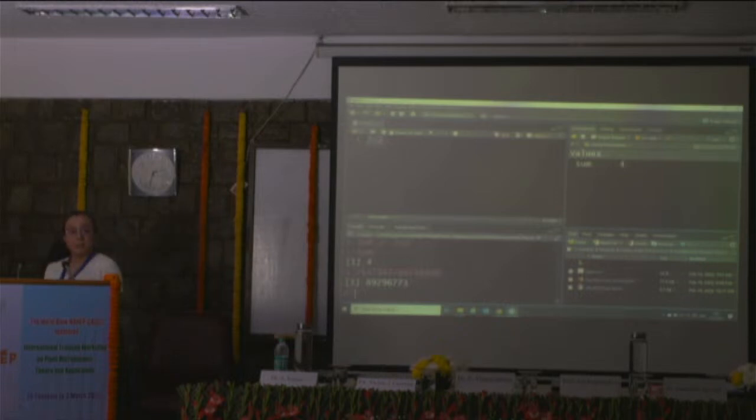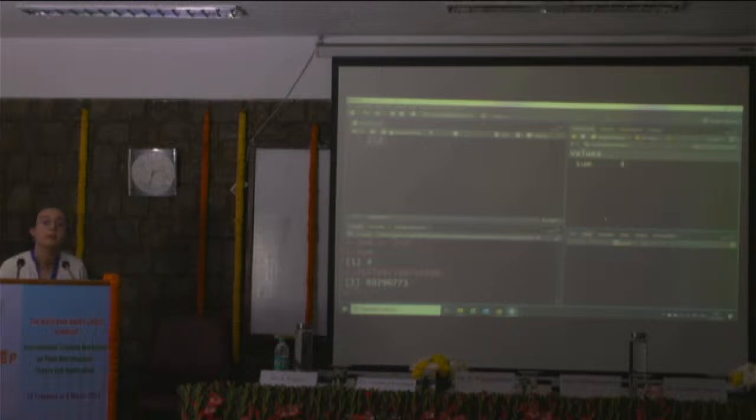And then another thing, a very good advantage for RStudio, and a great reason that the biologists I know use RStudio for the analysis, is the plots. You can see the plots right there, and not many programming languages have this. Usually you just have to write all the code, cross your fingers, and hope that the plot that you want is actually being produced, and then check later on. But with R, you don't have to do that. You can generate your plot and immediately see it in the plots tab. Right now it's going to be empty because we don't have any plots, but in the exercise we will have some, and you will see them right there.